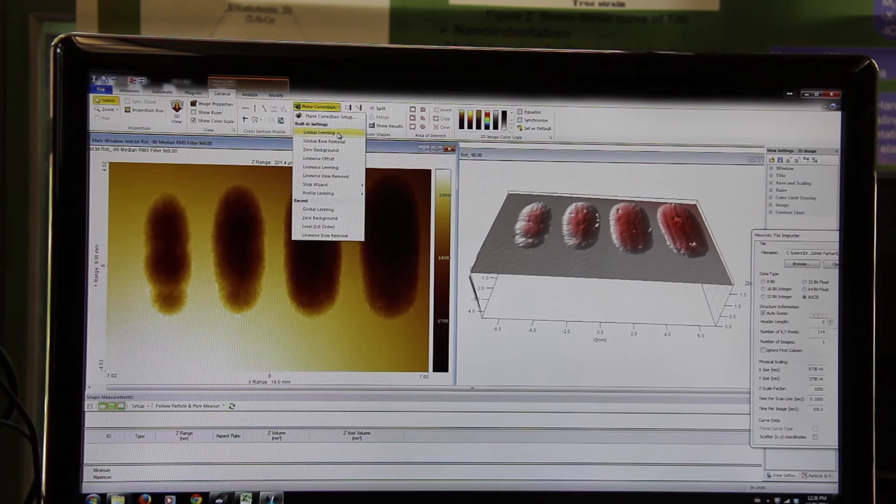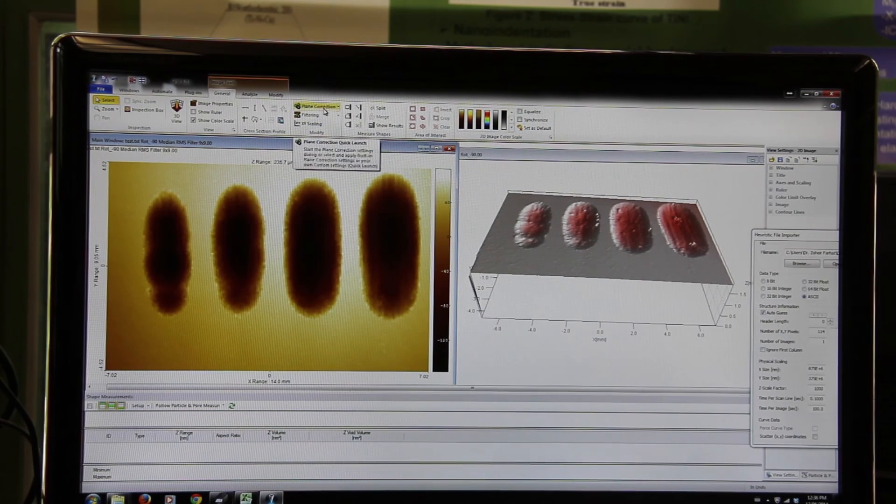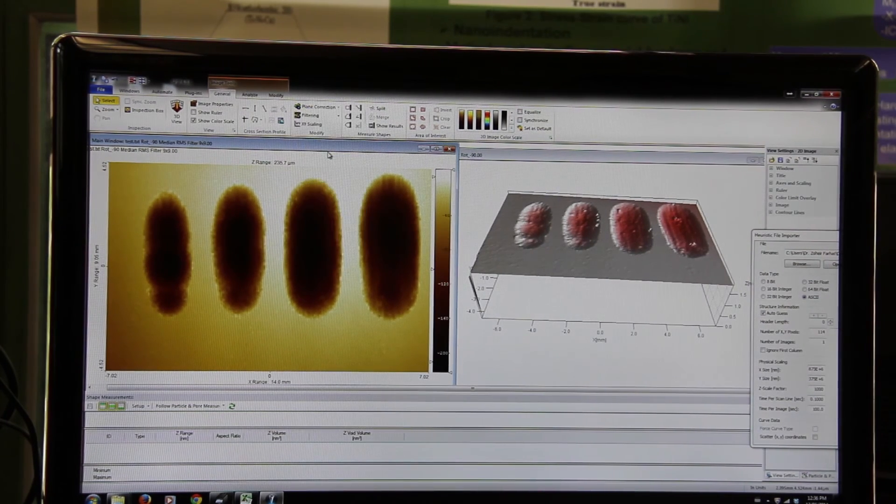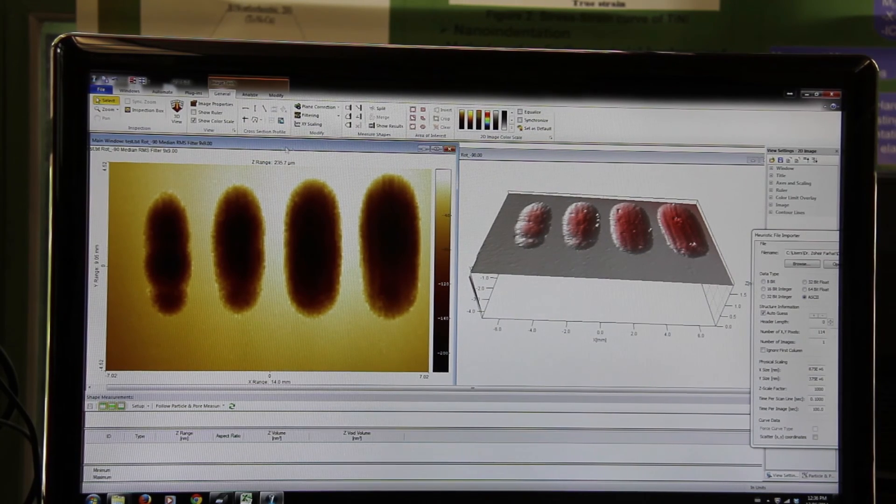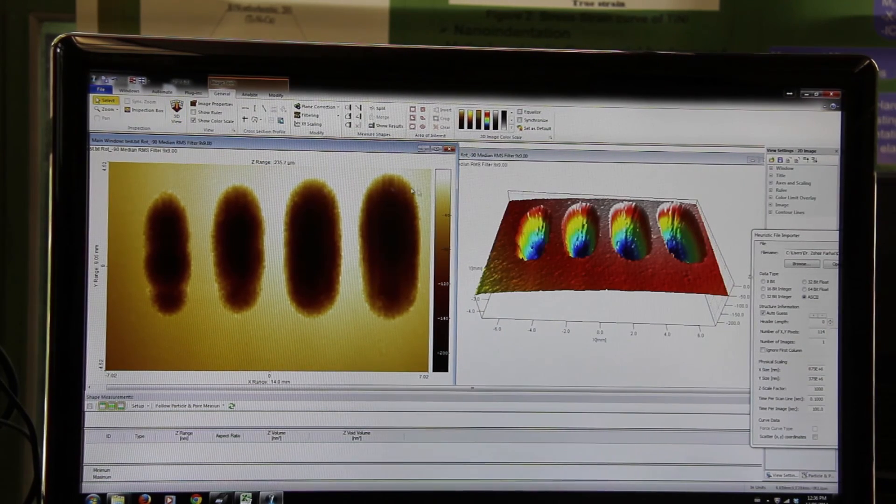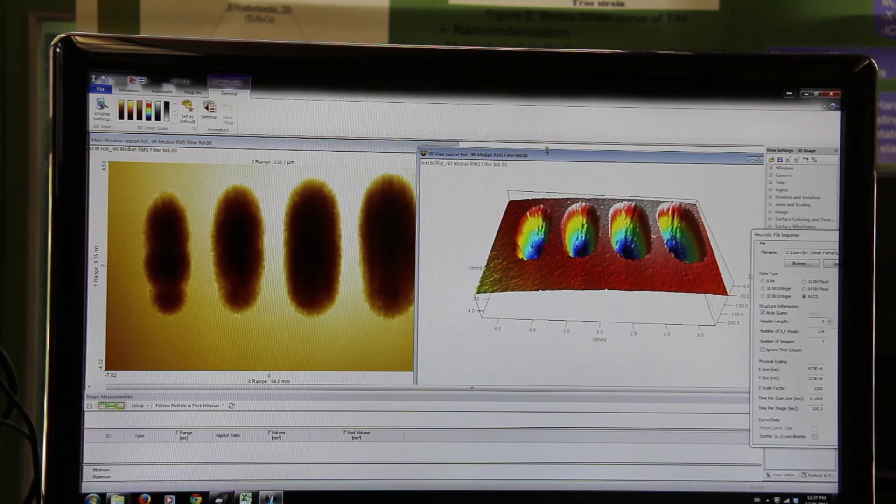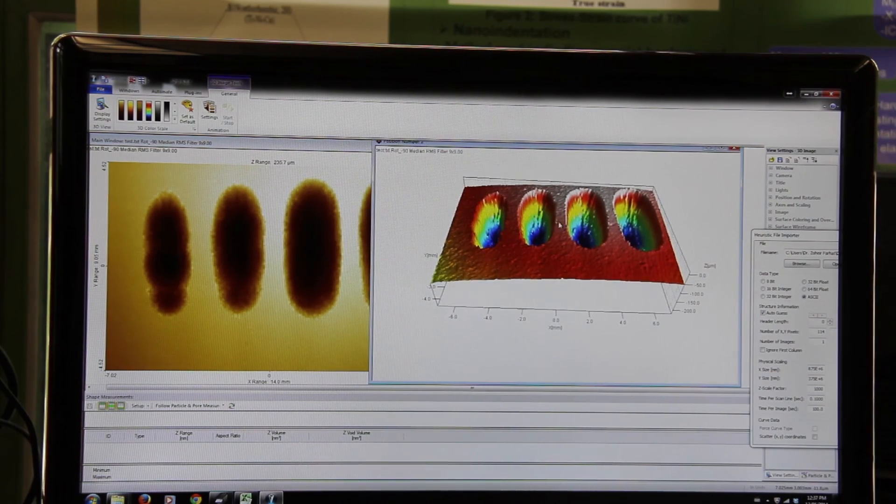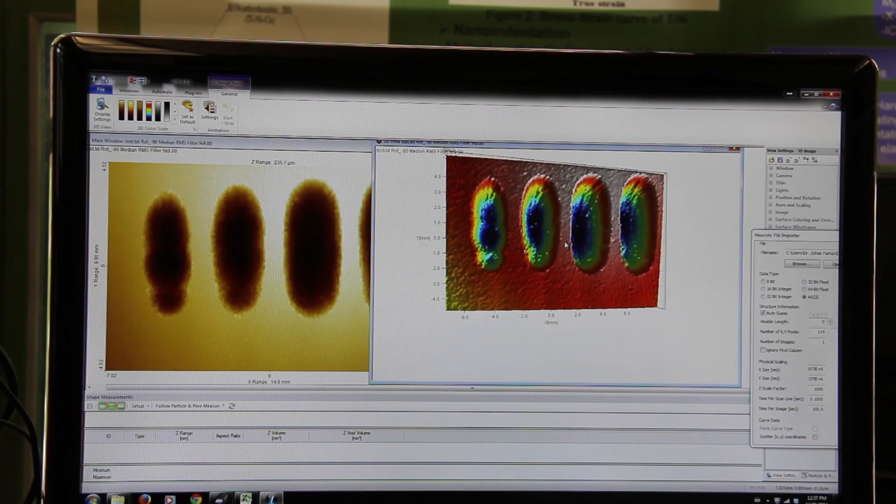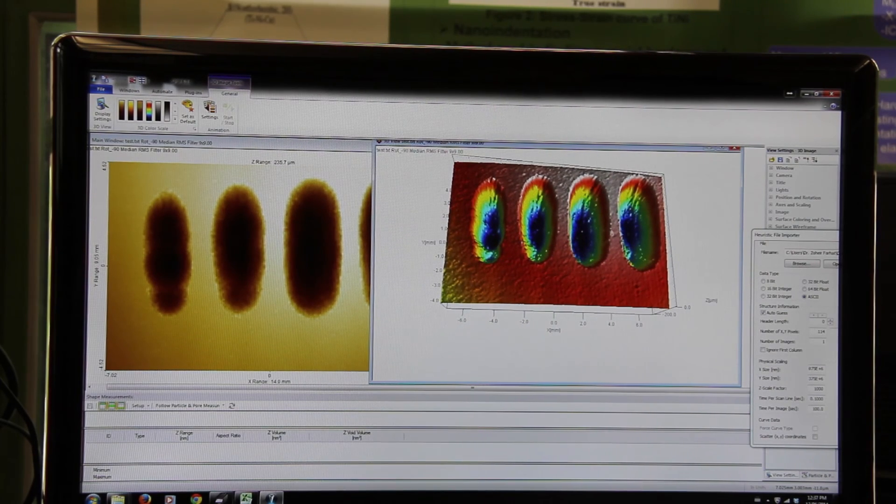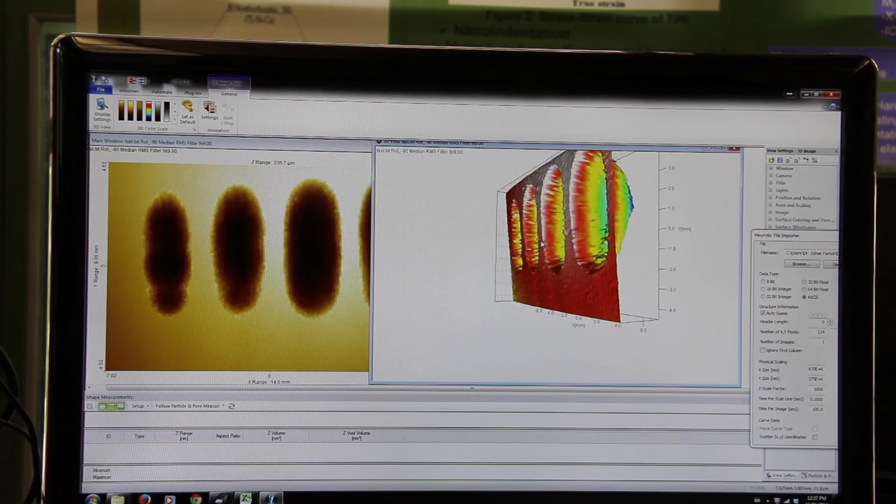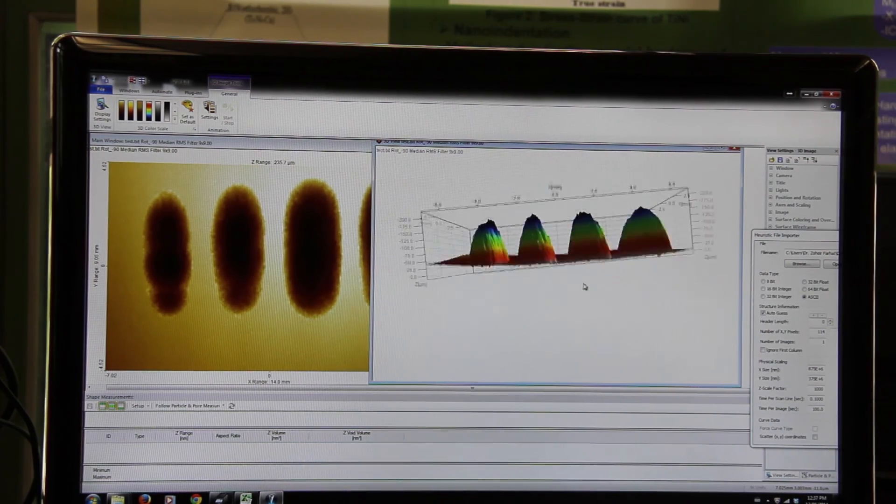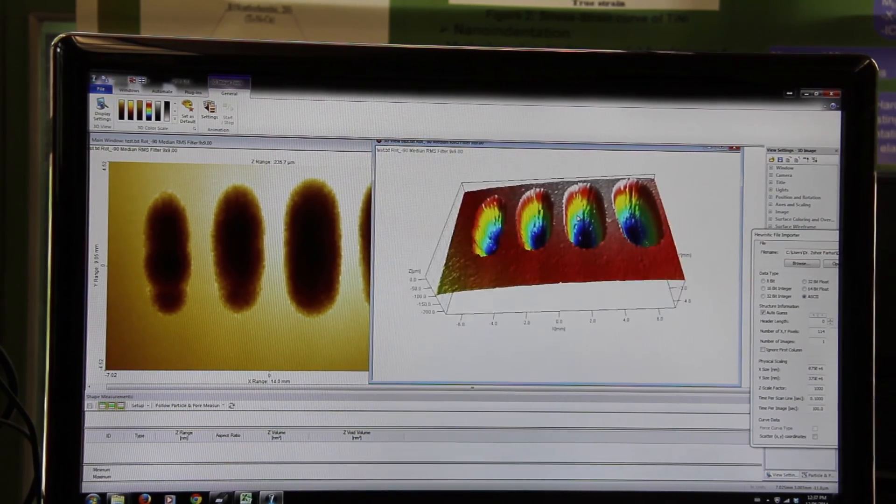And then go plane correction, global leveling, and then plane correction again, zero background. Hit 3D view. It will give you a three-dimensional view of your scan. So these are the four wear tracks that we have done, and you can see the three-dimensional view of this wear track from the profiler.